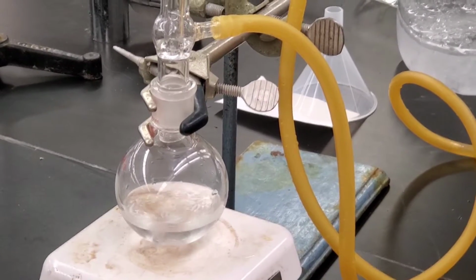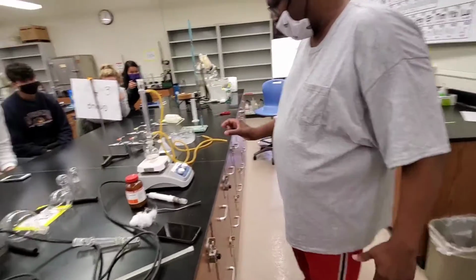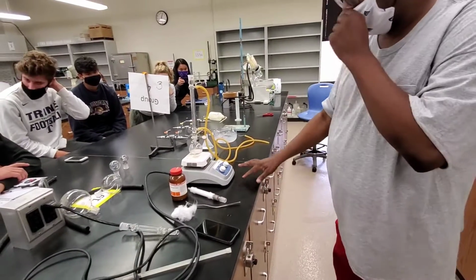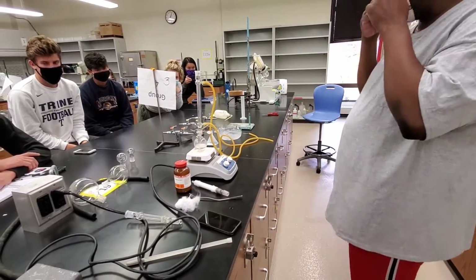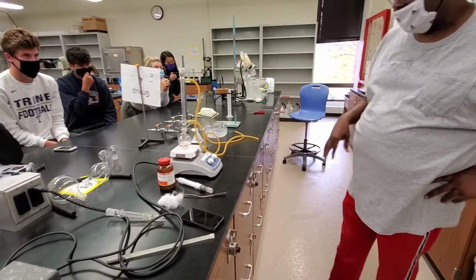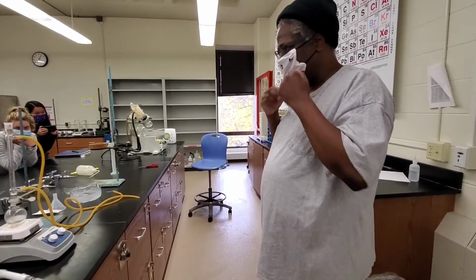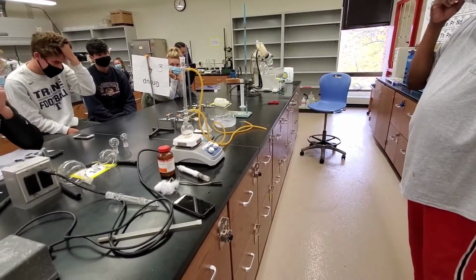Okay? So one of the things you guys are all going to have to do is, and I didn't bring stickies here, but you know what they look like, get a sticky, write your name, your telephone number, the start time and the end time for your reflux or for your reaction. If there are steps in between that you cannot get to, and I have to go take a look at it and do it for you, you need to put those steps there. It has to be clear for me. In fact, it might also be an advantage to actually leave your lab notebook, so I can see what steps are involved.